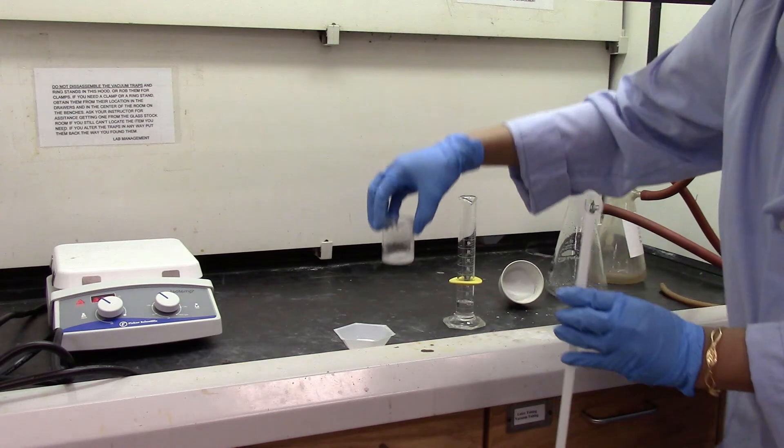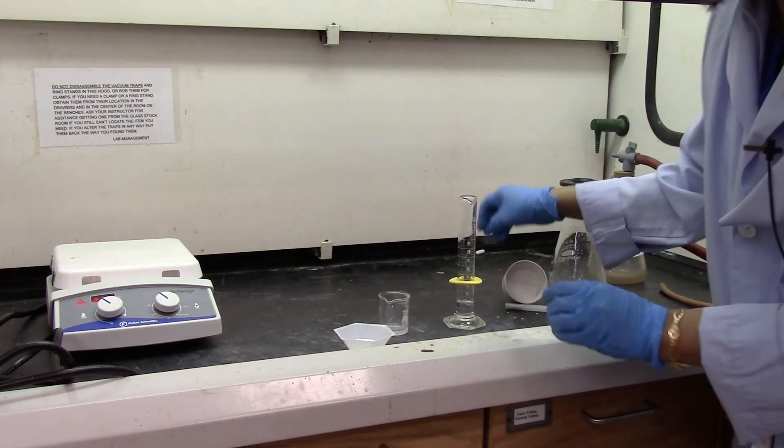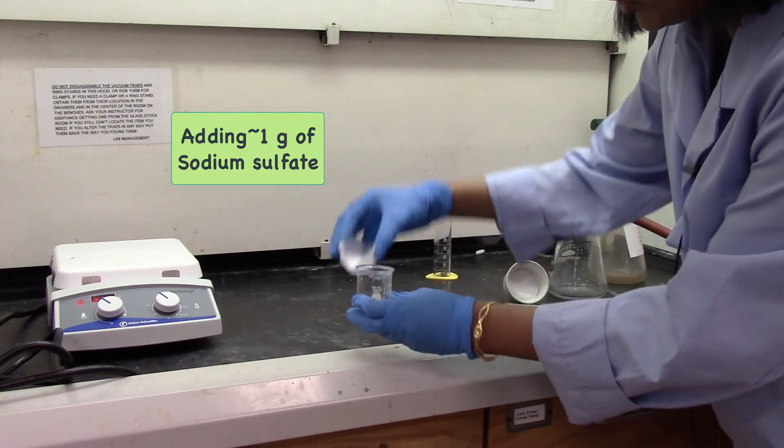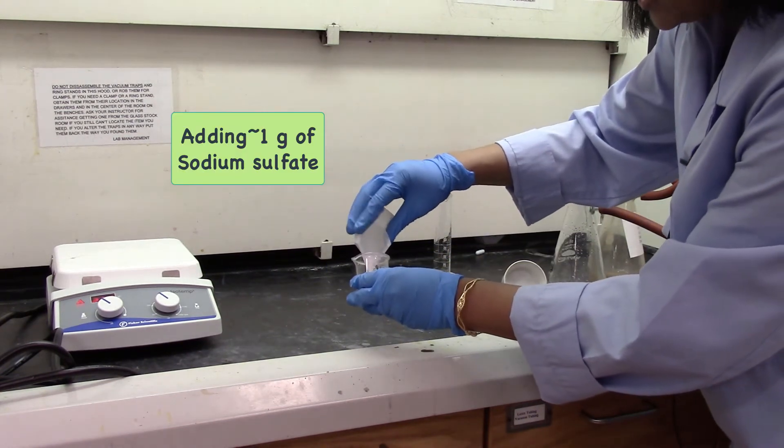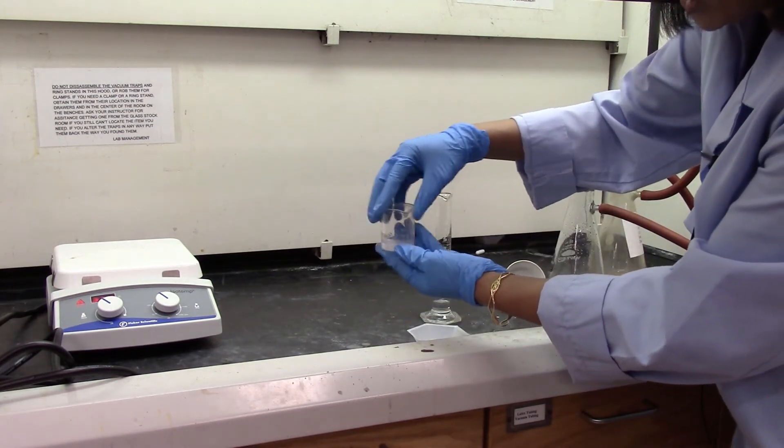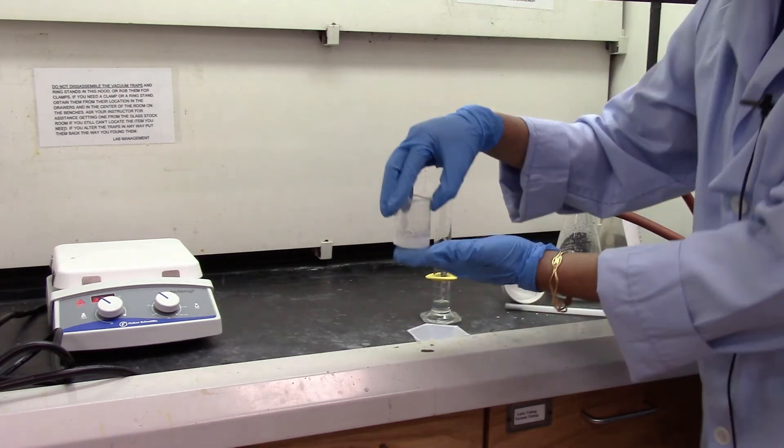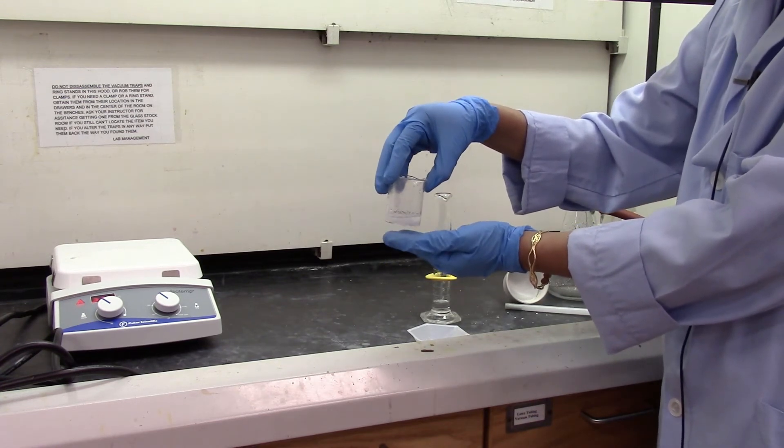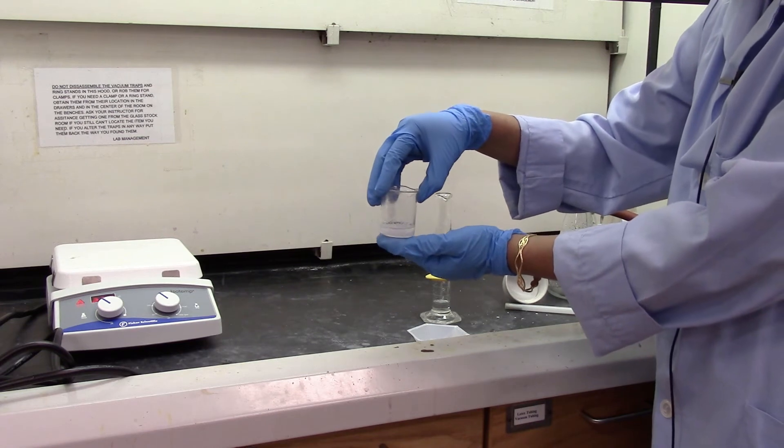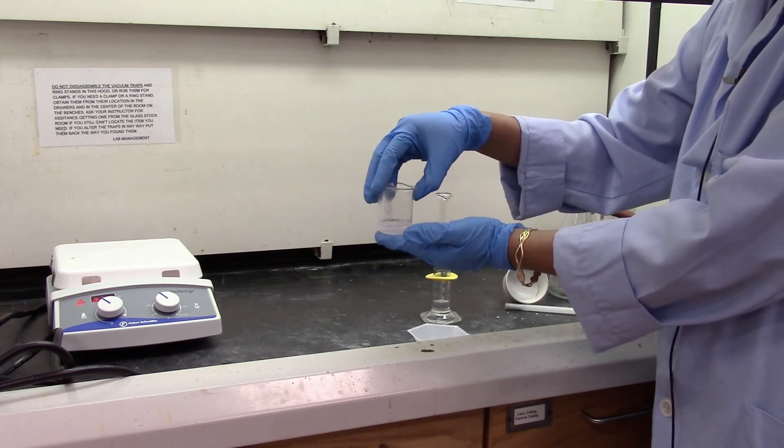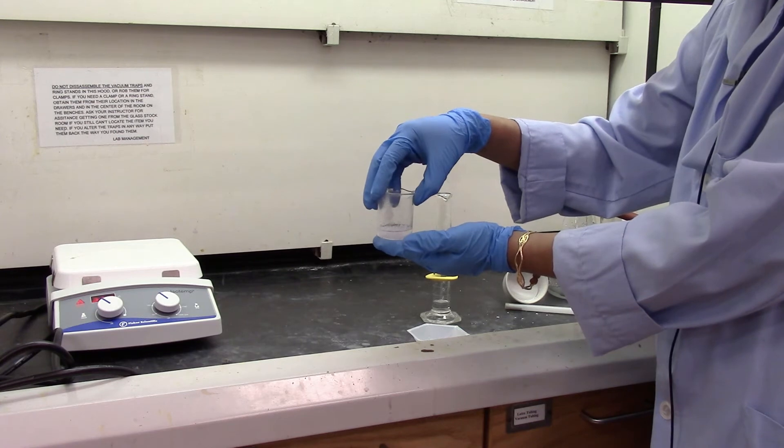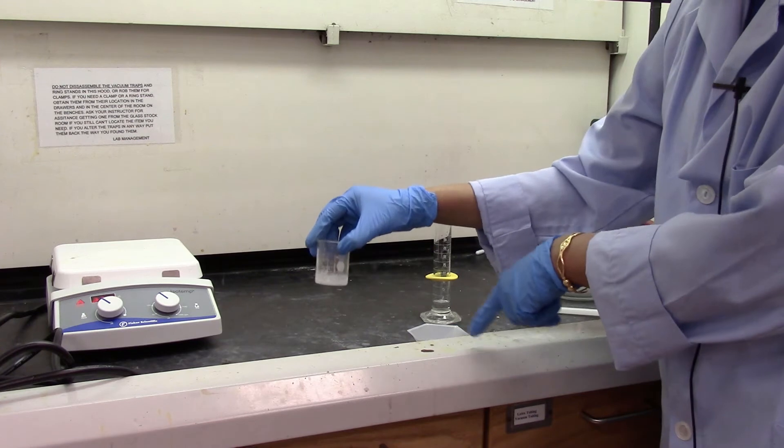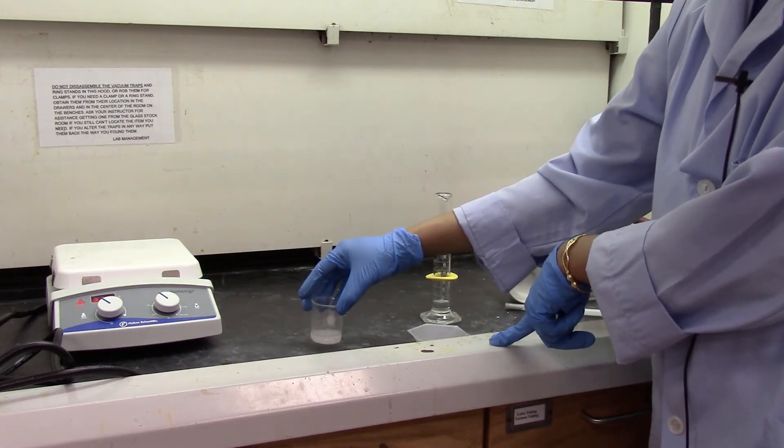I'm going to add some sodium sulfate drying agent to my product solution which is in dichloromethane. Give it a swirl. And then let it sit for about 10 minutes for the dichloromethane solution to dry off. If there's any moisture in the dichloromethane the sodium sulfate would absorb it. So I will let it sit, have it dry, and then transfer the liquid into a pre-weighed Erlenmeyer flask to collect my product.